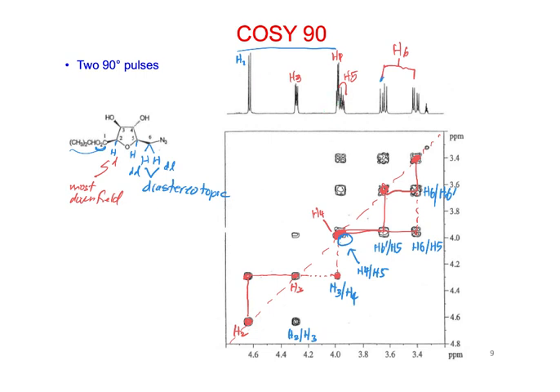I mean, we got the H6 and H5 just from looking at the molecule structure, right? H6 we basically had because we were looking at the molecule, and from what we looked at before, they kind of look like a diastereotopic pair of protons. At least the bigger peaks here are slightly slanting towards each other.